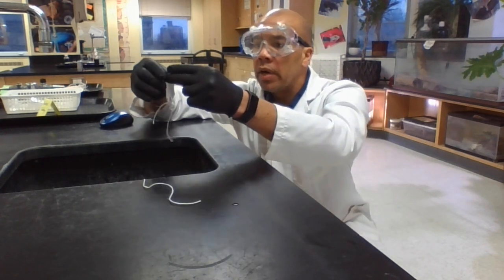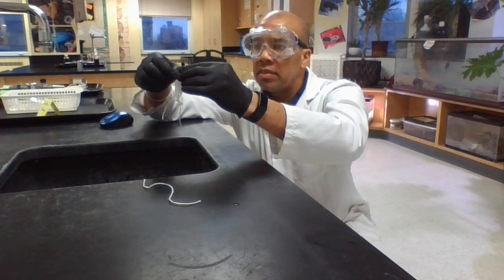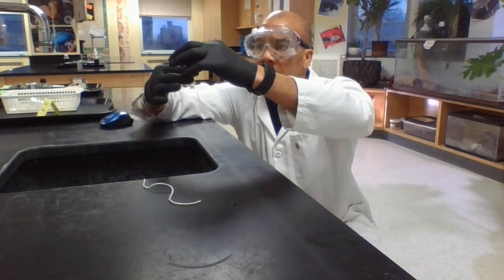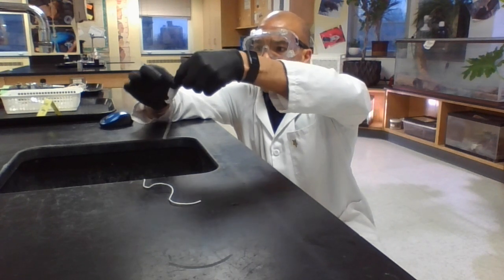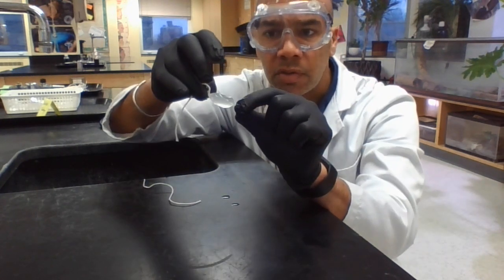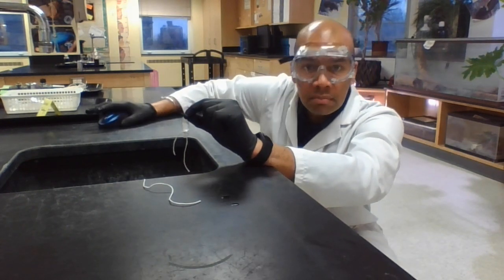What you're going to do, again, you're going to fold it down, and some of this liquid is going to escape, and that's okay. Fold it down and then just twist it. Okay, twist it, and then have the other partner tie this side. So it almost looks like a Jolly Rancher when you're done. Let's see how I do. See you in a second.